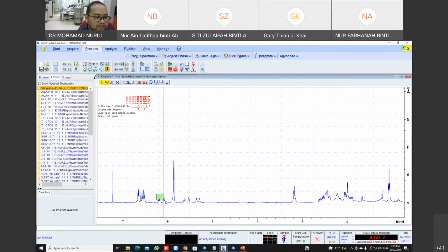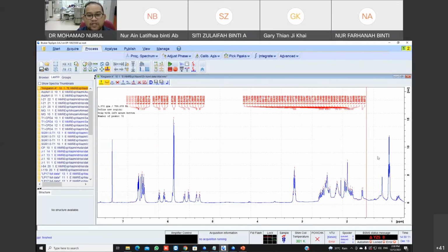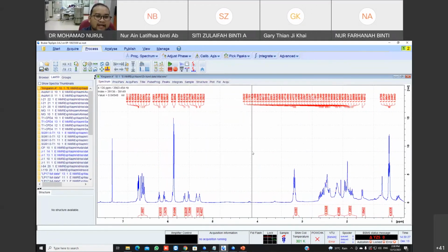Okay, tengok dia buat manual. Ni better lah you buat manual sebab machine ni kadang-kadang dia pening. I campur bahasa Melayu bahasa Inggeris. Dia buat manual. Manual maksudnya you buat satu-satu. Okay, dah buat semua, save jangan lupa. Kalau you lupa save, you kena buat lagi sekali. Memang pening lagi. Okay, dah settle.